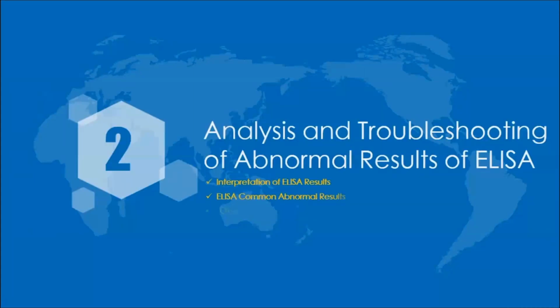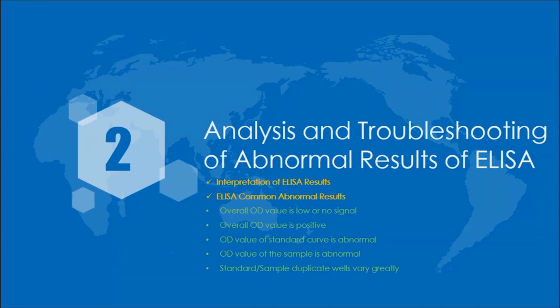Now let's move on to the main part today, analysis and troubleshooting of abnormal ELISA results. During the presentation, please feel free to type your answers in the chat window, and we will answer them one by one later. In this part, we will talk about how to interpret an ELISA result and the possible causes for some common ELISA abnormal results.